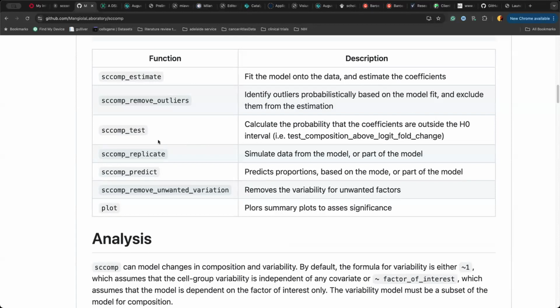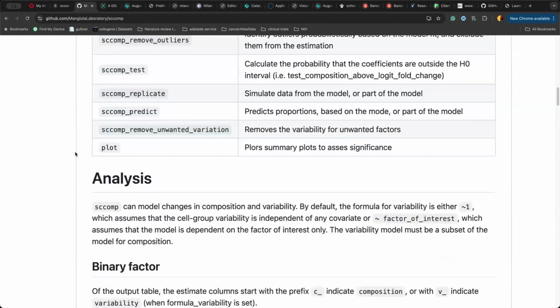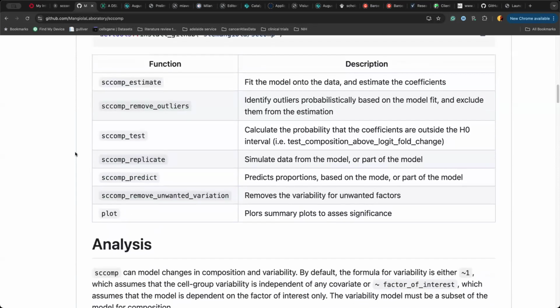If you ask me, modeling the data as counts is very important, beyond compositionality. I also would expect that. We have a paper with a quite thorough benchmark on that.